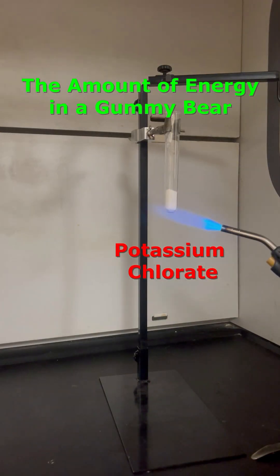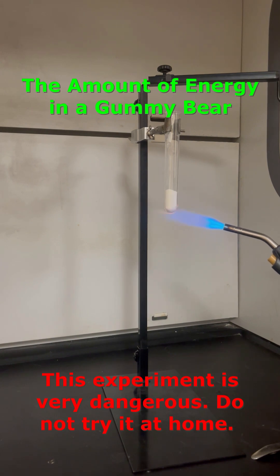If you take 10 grams of potassium chlorate and heat it up until it liquefies, it decomposes to produce oxygen gas.